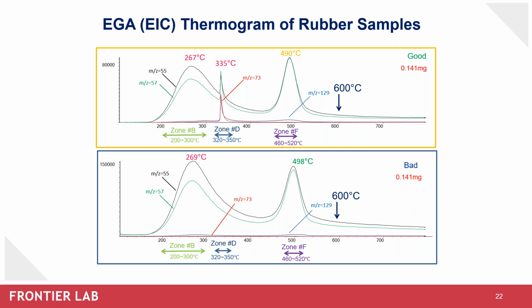On the other hand, with the headspace sampler, based on my experience, they can handle several hundreds of milligrams of samples, but the thermal desorption of the targeted compounds, which are hiding inside the sample matrix, will be very challenging. And because headspace samplers are typically limited to 200 C, and most of them have a relatively long flow path from the sample heater to the GC injection port, compounds analyzed by headspace sampling are generally limited to relatively low boiling compounds, typically up to C20.